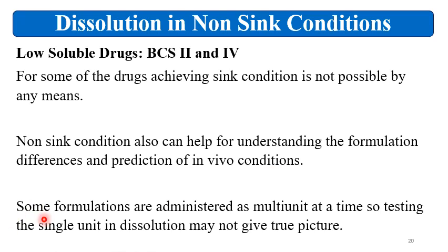Then some of the formulations are administered as multi-unit at a time, so testing the single unit in the dissolution may not give the true picture. And based on these characteristics of the formulation and the API, the applicant can justify the use of non-sink condition for the dissolution testing. As for some of the low soluble drugs, it is not possible to have the sink condition.